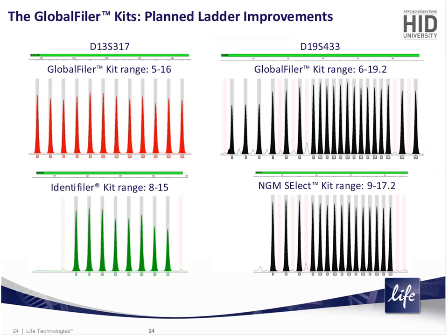Now, since many of our earlier systems were developed, we have identified additional alleles, and therefore the allelic ladders in some of our early systems do not incorporate all of the current alleles that are on reported databases. And this may mean additional manual editing requirements for some laboratories. If an allele that they encounter frequently is not within the ladder and is not genotypable based on that ladder, we need to run extra tests in order to confirm it. To expand the allelic ladders would mean a reduction in the number of additional runs needed to confirm the identity of an off-ladder allele and also maximize the efficiency of genotyping.